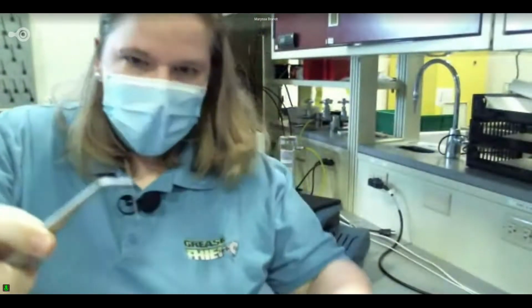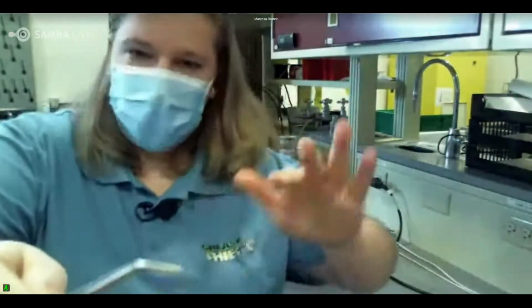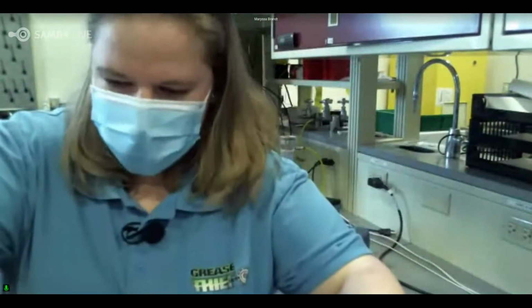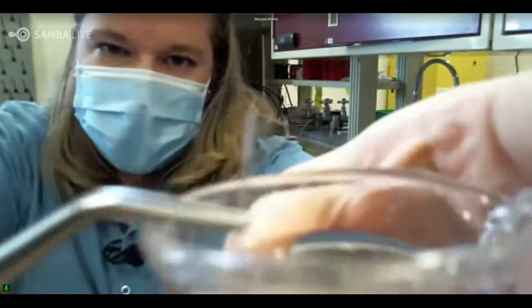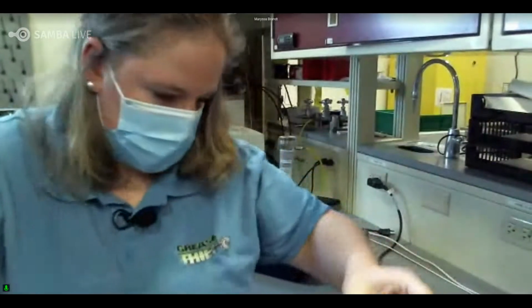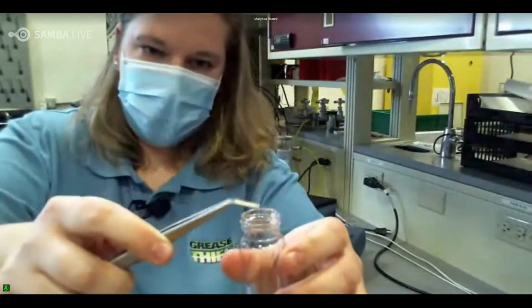Once I put this in water, the vial will fill up with water very quickly. It's something that you learn to look for, but we're just going to do that. And it filled up that quickly with water. And so now we're going to tap off the excess, and we are going to put it into a moisture vial.